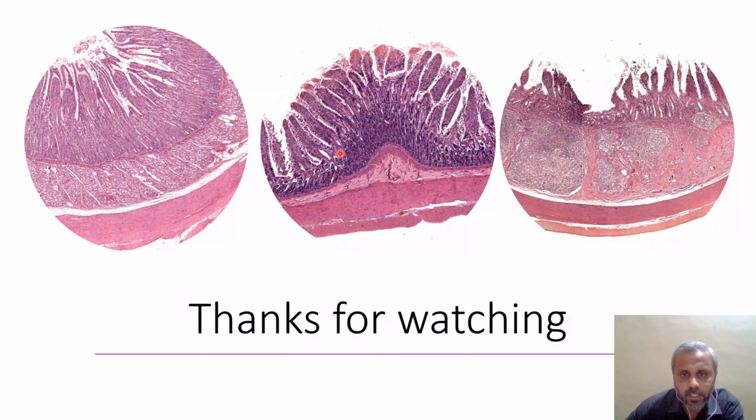We can compare the three slides of small intestine. Duodenum has finger-shaped or leaf-shaped villi, and the characteristic feature is presence of submucosal glands referred to as Brunner's glands. Jejunum shows characteristic circular folds referred to as plica circularis, and the villi are much taller than the villi of duodenum. The ileum has characteristic Peyer's patches in the submucosa and club-shaped and short villi.